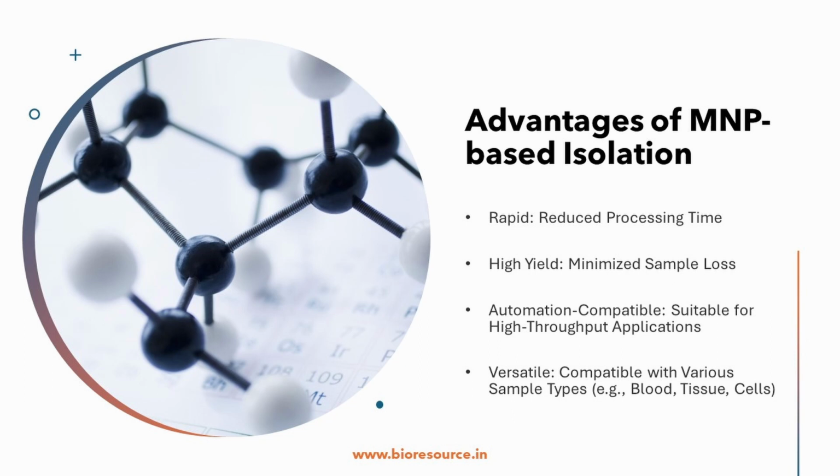One is that it is very rapid and requires reduced time compared to traditional methods like phenol-chloroform extraction or centrifugation. MNP isolation is significantly faster, and the magnetic separation step allows for rapid isolation of the target molecules, significantly reducing the processing time. This is particularly beneficial for high throughput applications where processing numerous samples is necessary. So this is one advantage: it is rapid and it supports high throughput sample processing.